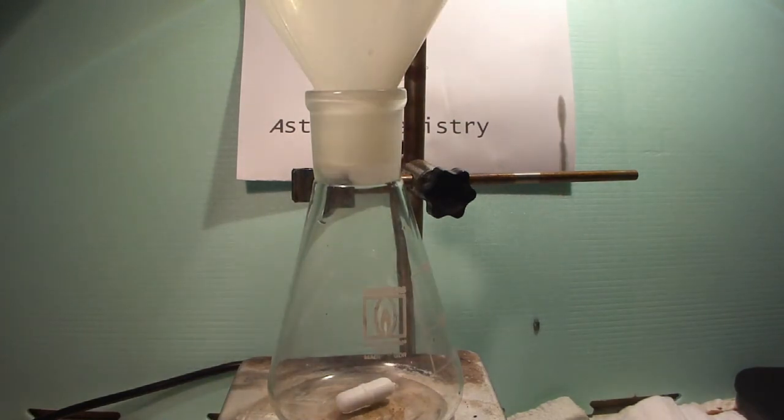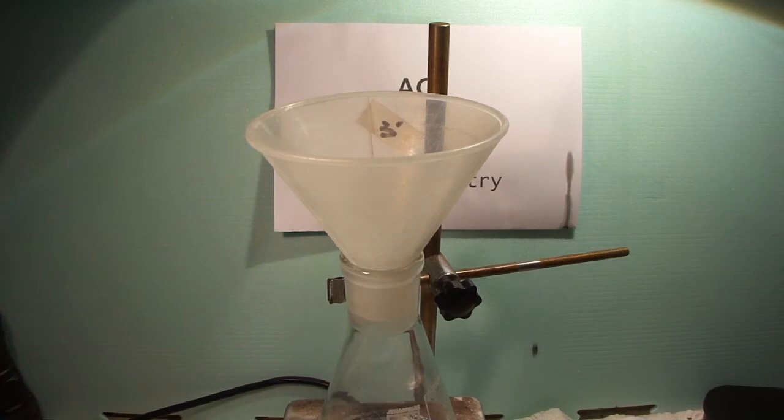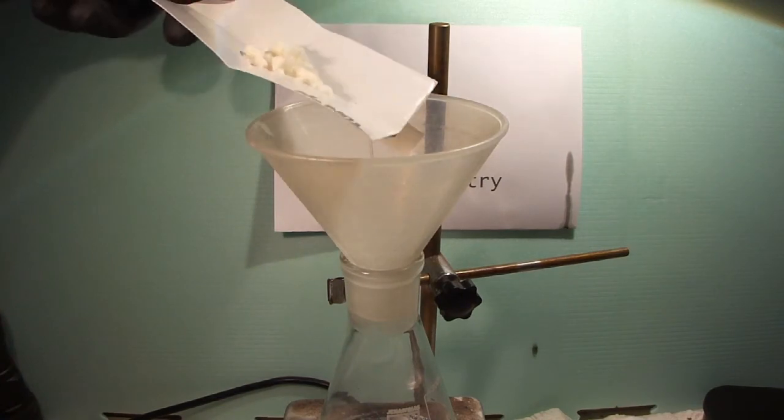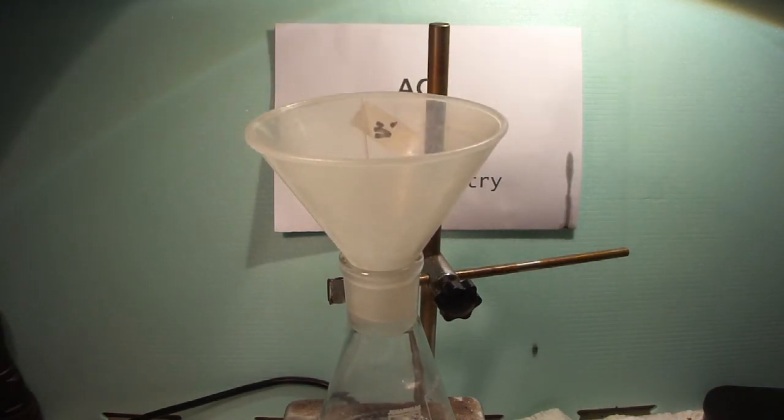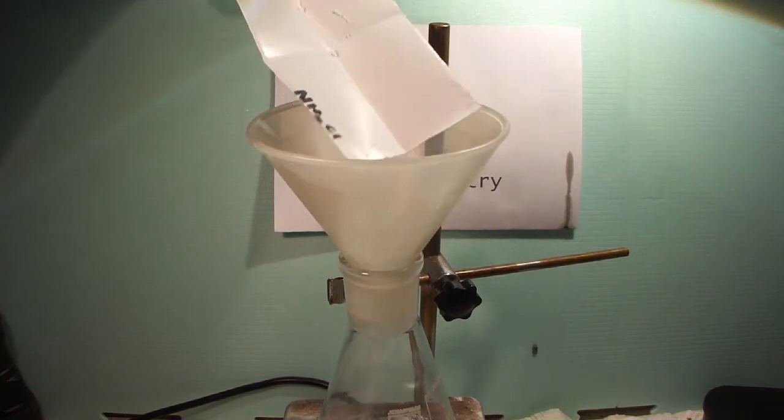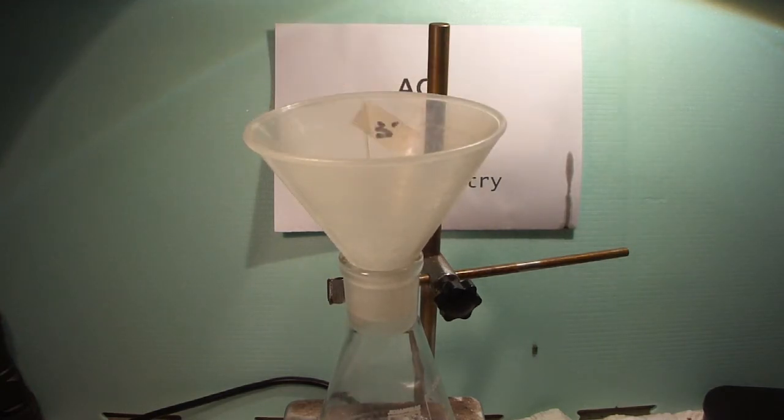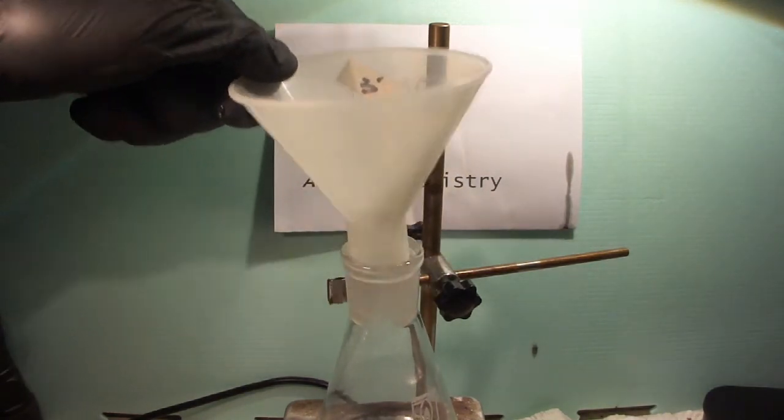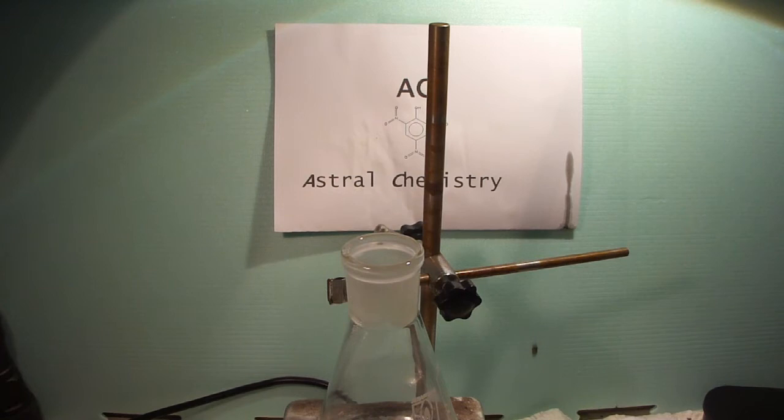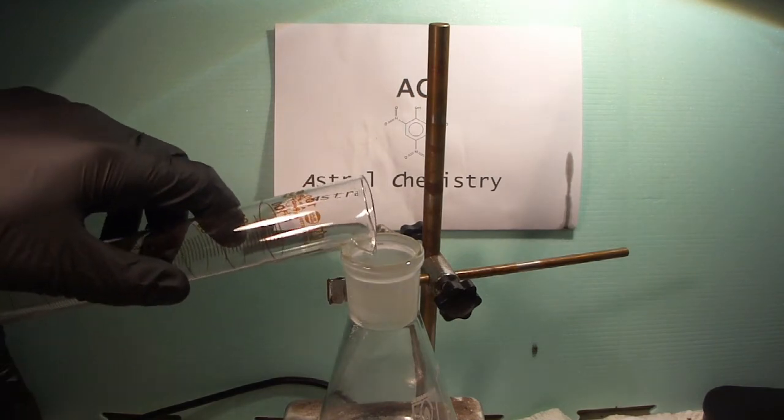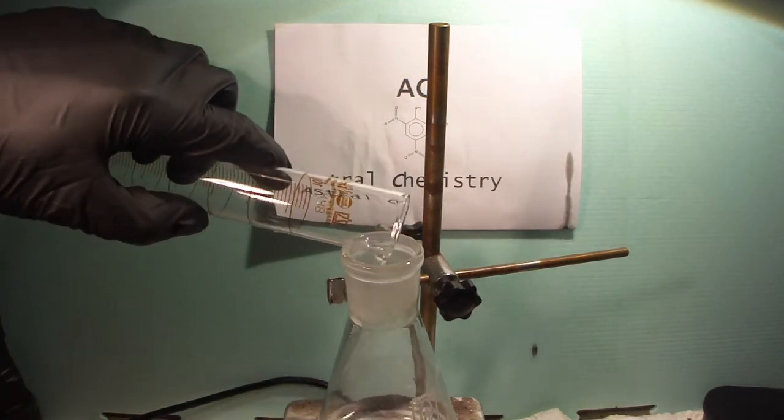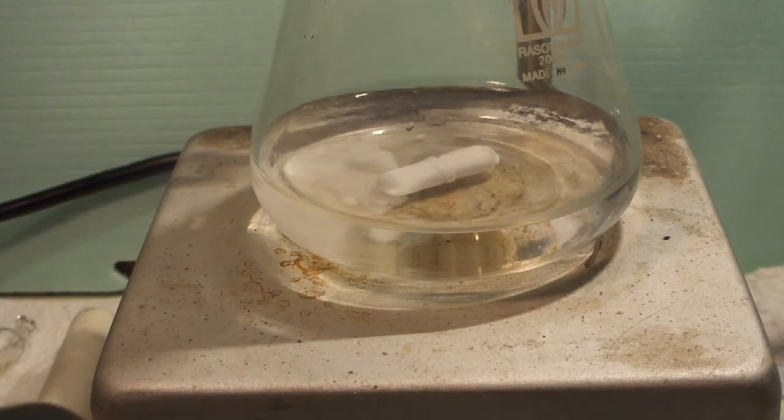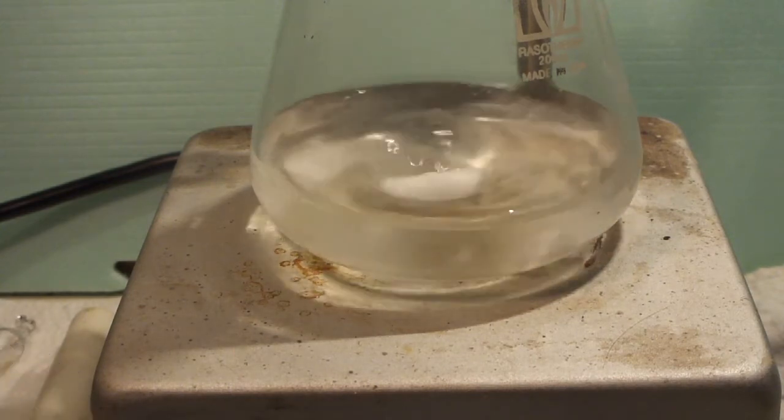Then, equip an Erlenmeyer flask with a stir bar and a wide mouth funnel and place the flask on a hot plate. Add the sodium nitrite and the ammonium chloride to the flask, followed by 47 milliliters of distilled water. The exact amount of water is not critical. Just make sure that both solids dissolve. Do not forget to turn on stirring.